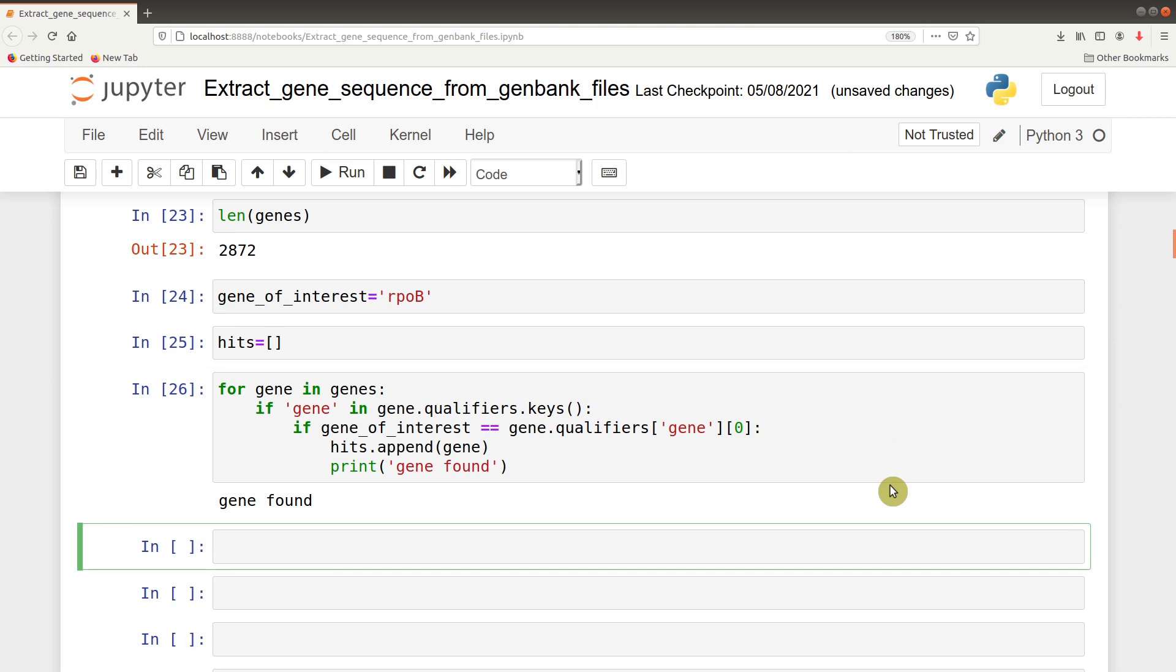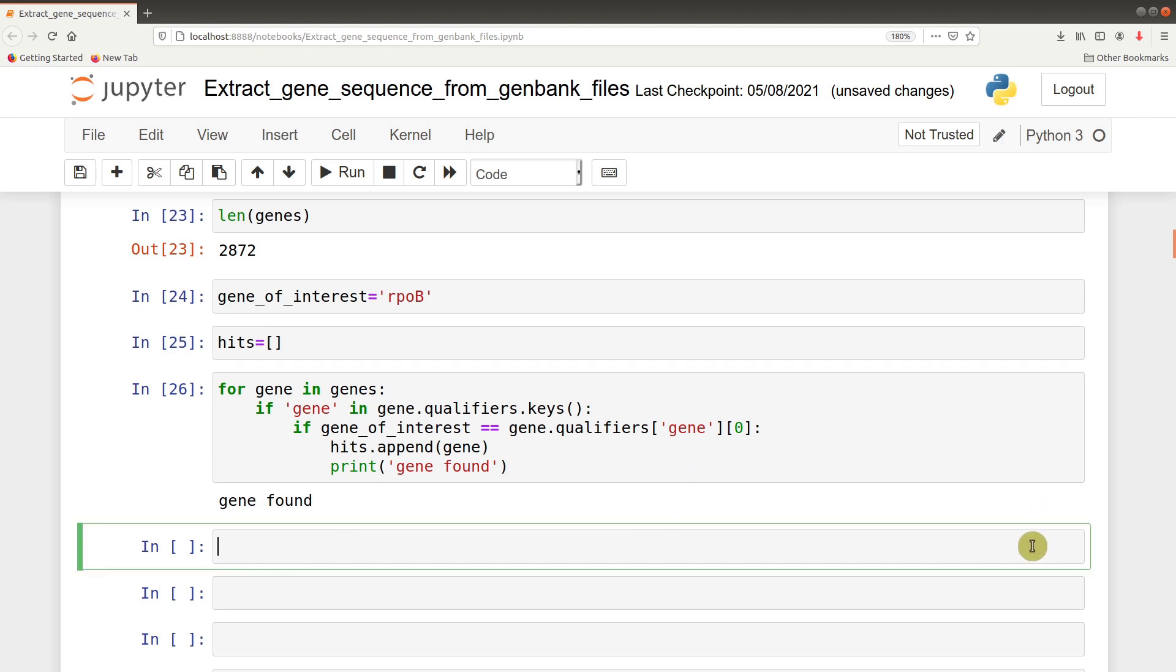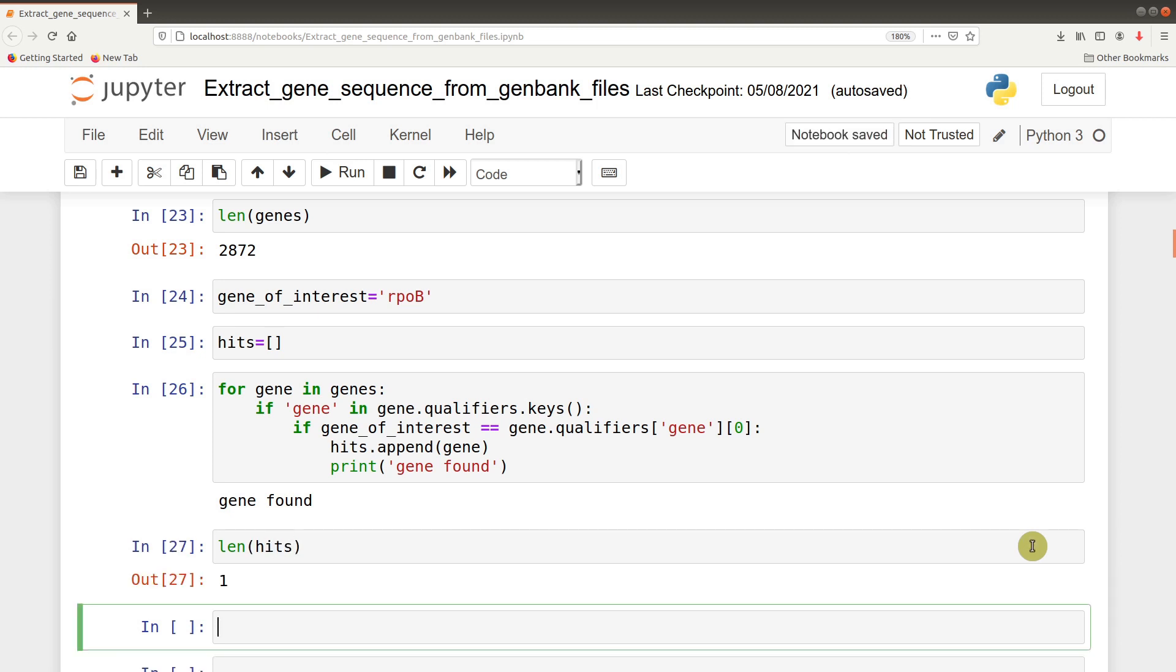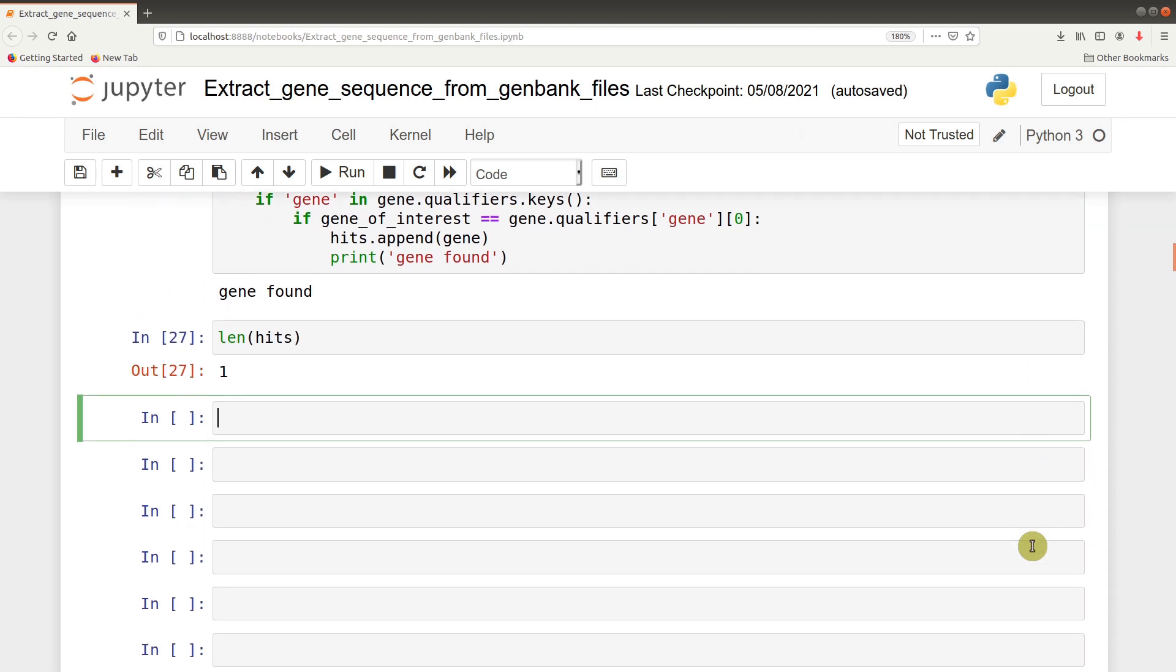After issuing the command, notice we have gene found. That means there was a hit returned. We can check it from the hits list we created - len hits gives us 1, indicating we have that gene returned and it's only one that was given. That's good because we have that hits list there.